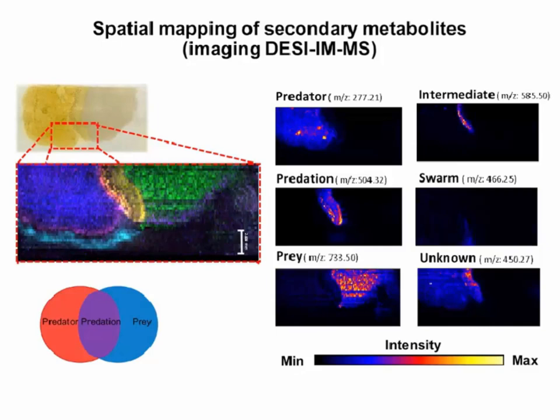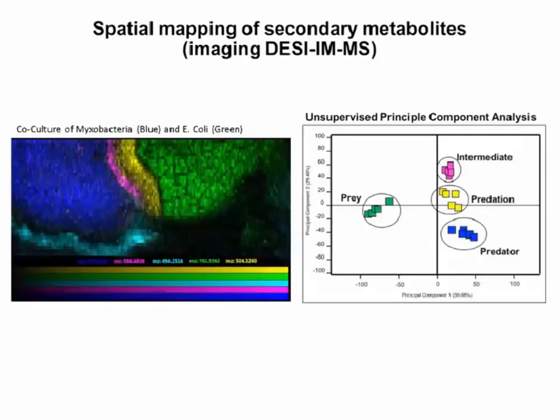As you can observe, this unknown m/z in the bottom right travels across the image towards the prey in a dynamic way. The intricacy in these features, as well as the other thousands that we were able to annotate, allows us to use statistical analysis and prioritize these new molecules in the drug discovery workflow.